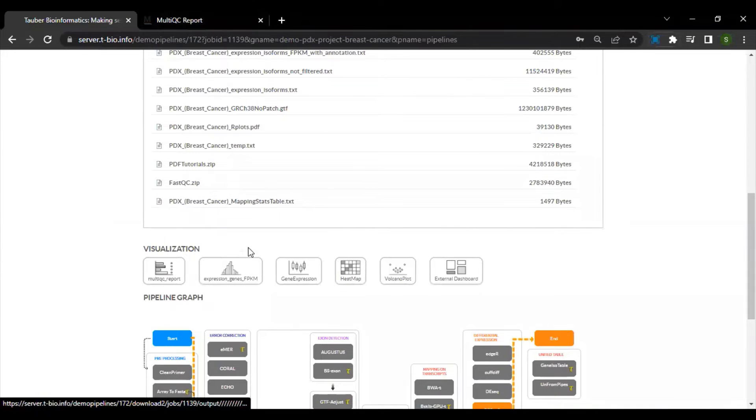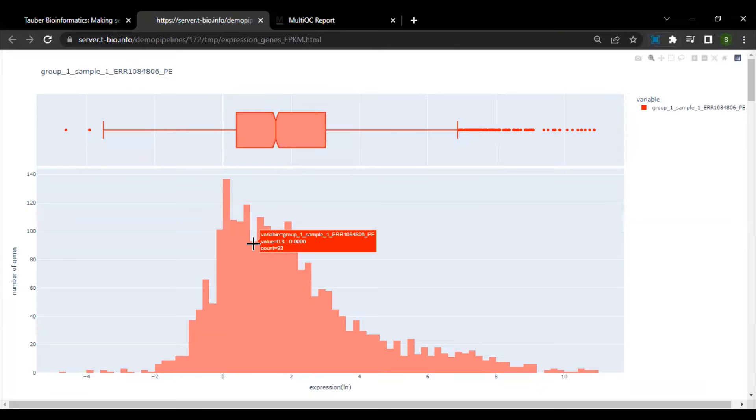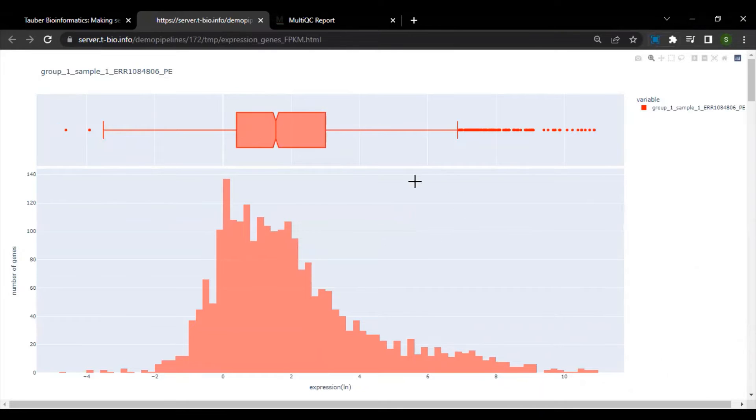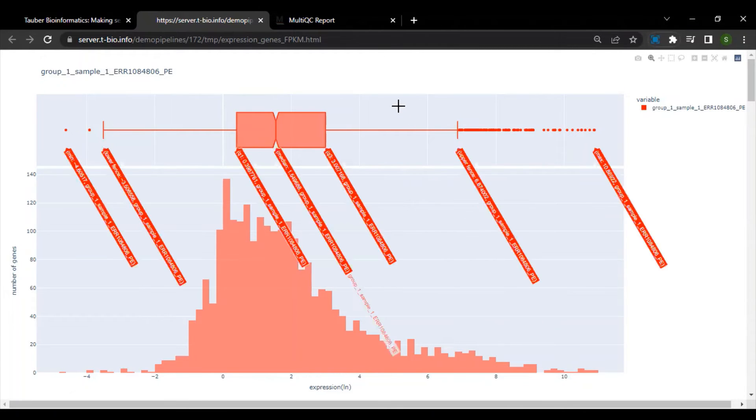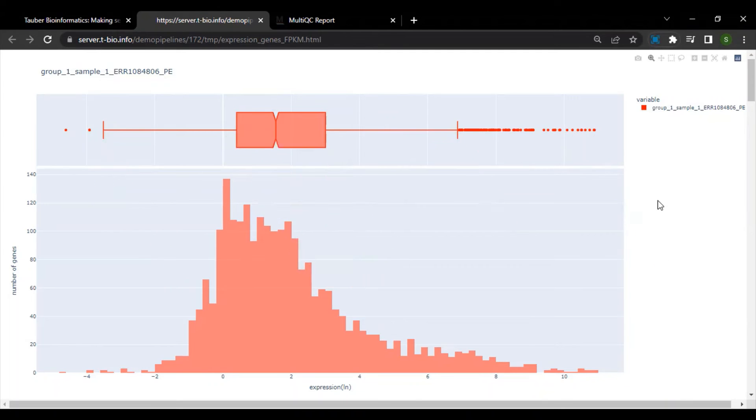Another important visualization option is the gene expression that has been expressed in FPKM values and represented in the form of a histogram. On the top, you can also see the gene expression of the sample represented in the form of a box plot.